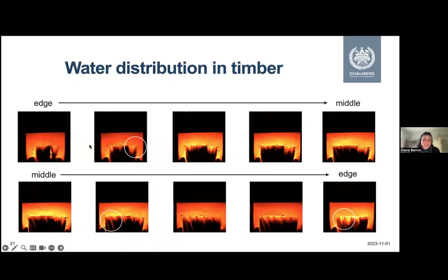But here is another way of looking at it, not like the axial slices that you have seen before. These ones are sagittal ones. That's what you call it. That's hospital language, but chemical engineering MRI also says coronal and sagittal. So here we start from the edge, then we go into the middle, and then again to the edge.